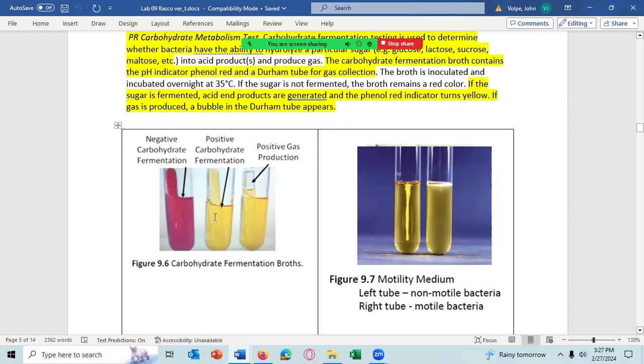You should really not incubate it longer than a day. If you do incubate it for 2 days and you put in a whole bunch of growth, you may metabolize all the glucose, and then you start metabolizing the protein, and then that can revert the color. So it was yellow, but with more time, it starts becoming pink. This is not a problem in our unknown test because I won't allow the test to run that long.